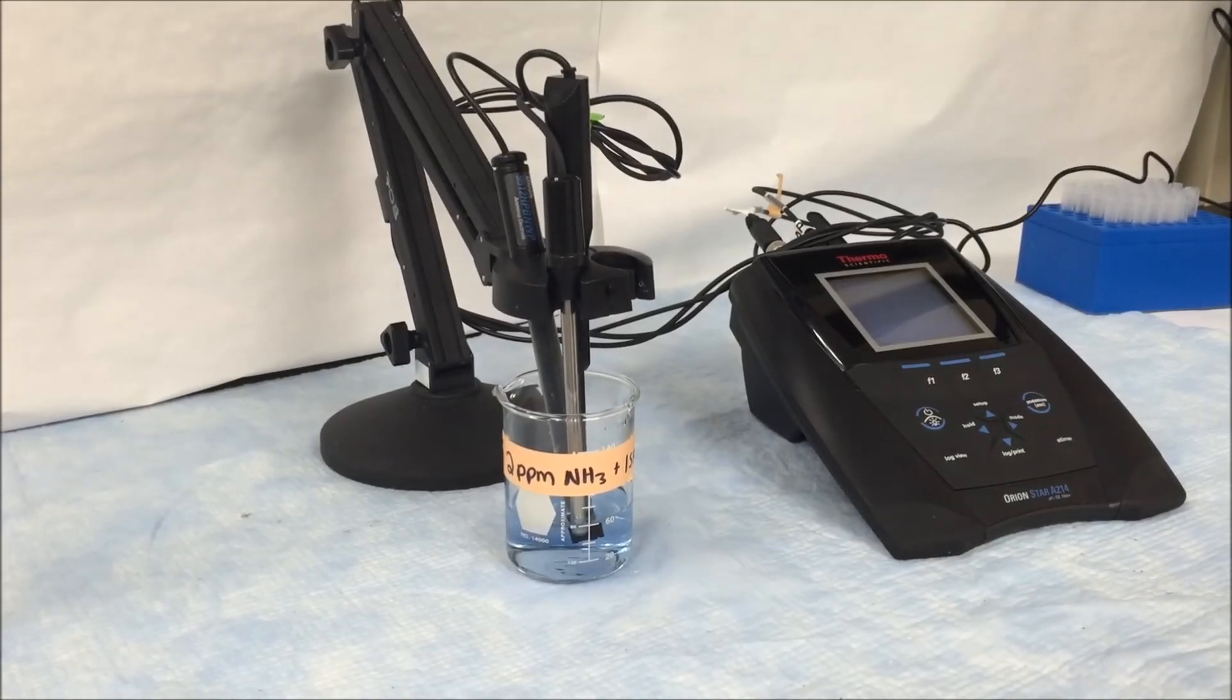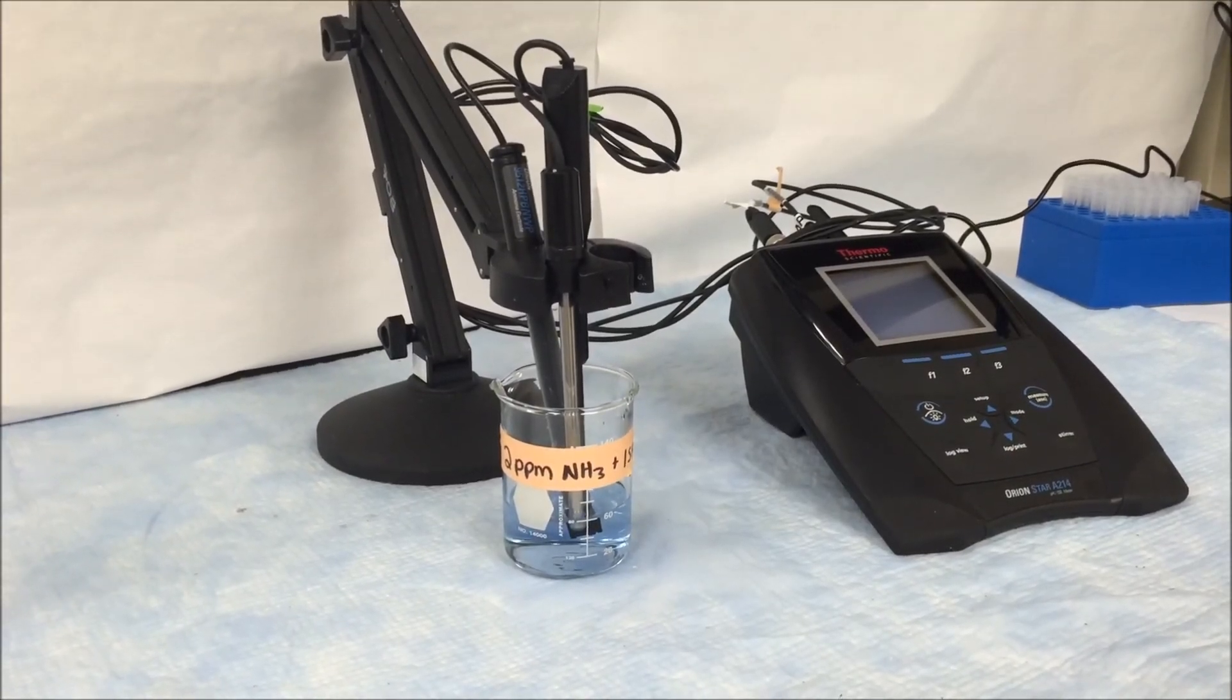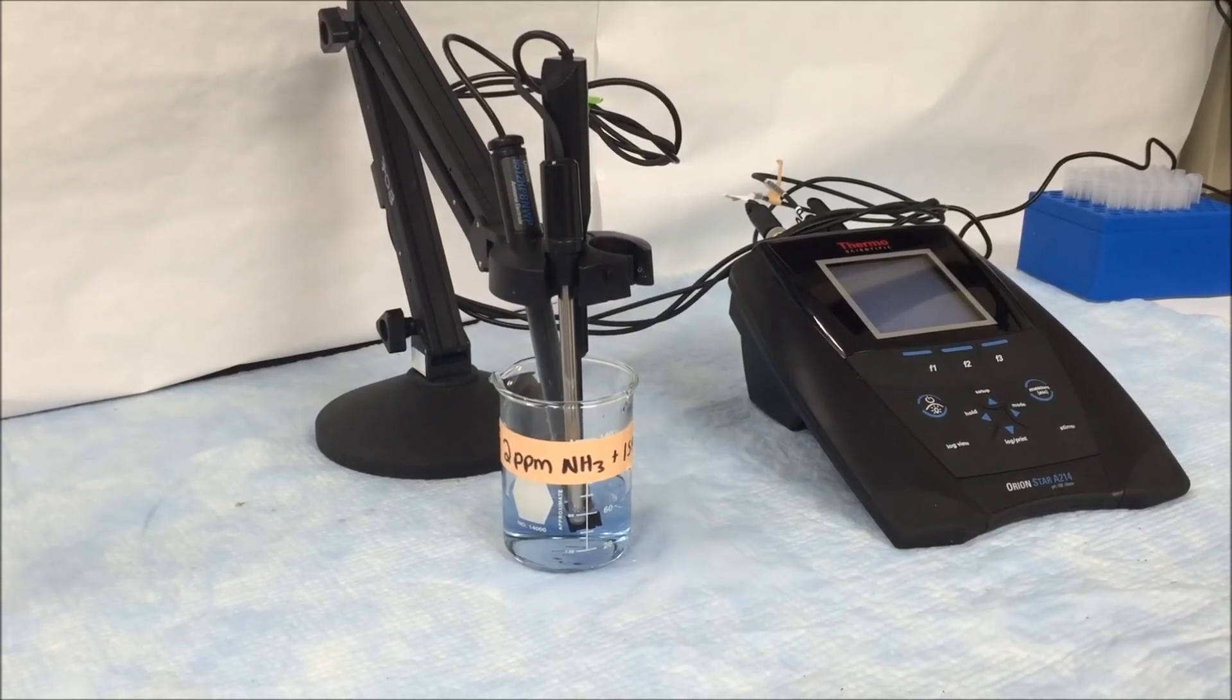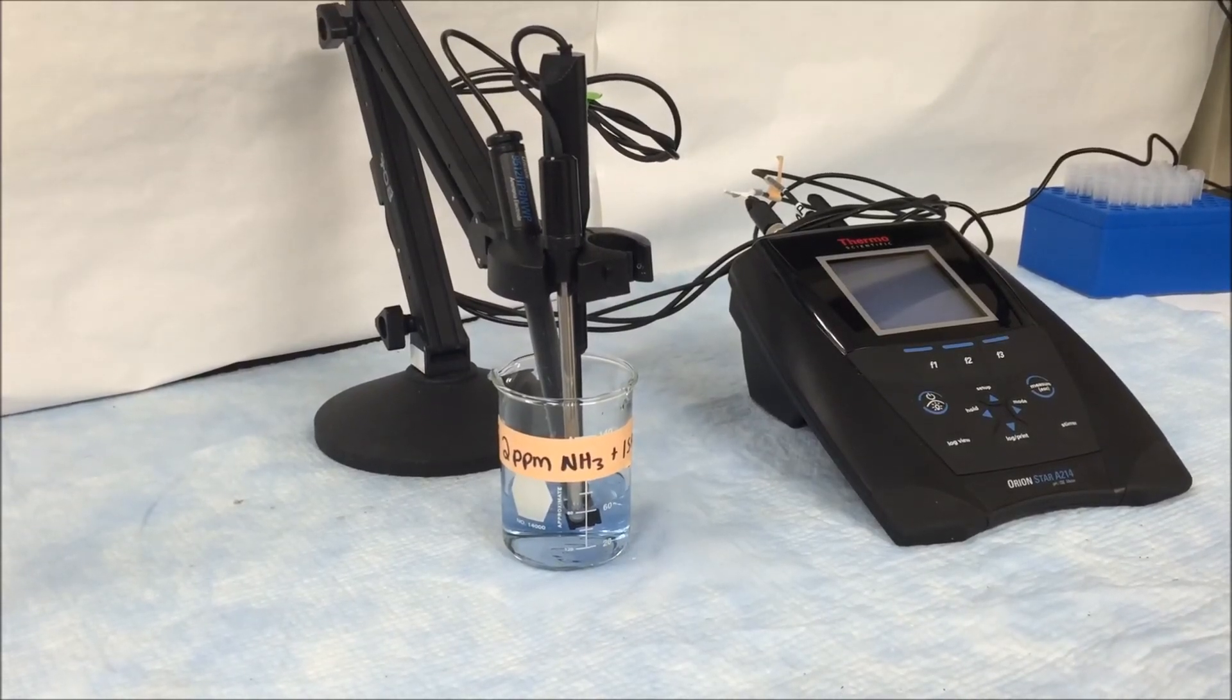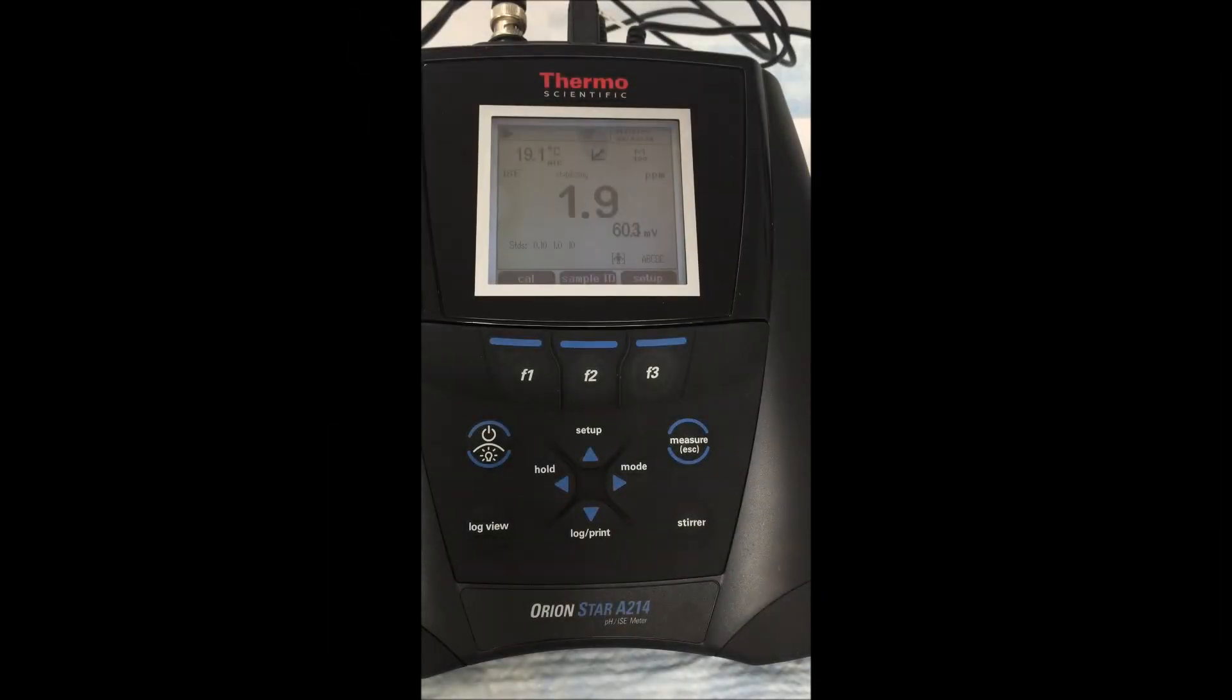Moving on to our check standard at 2 parts per million, we're going to verify that our calibration technique was successful. Waiting for the meter to finally register as ready, we see that our meter then reads back that check standard at 2 parts per million. If you have any other questions, feel free to contact us at Technical Service.